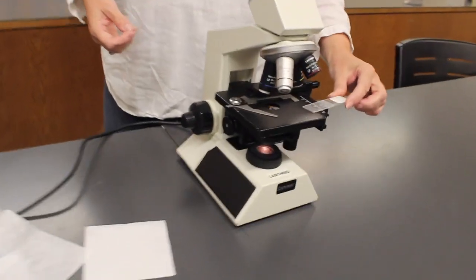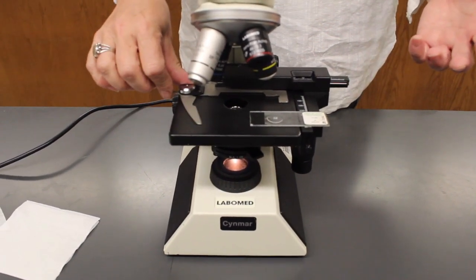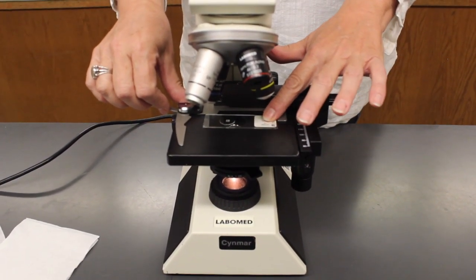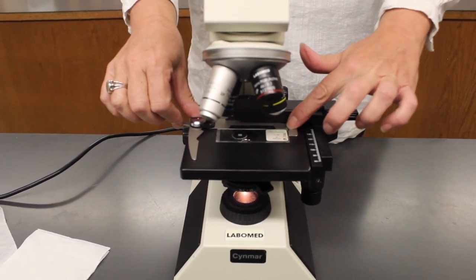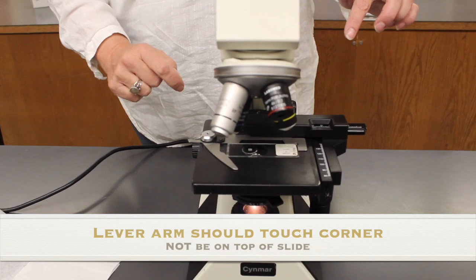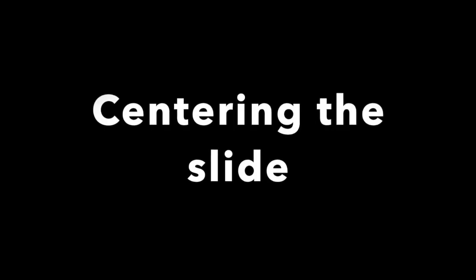The way I do this is I literally just lay it on the stage like this, and then with my right hand, I'm going to open the slide holder lever arm. You can see that opening. And then slide the slide right into there so that it fits very snugly in this little L shape. And then gently close that lever arm so that it's snug up against this corner. Now you've got the slide seated in the microscope properly.